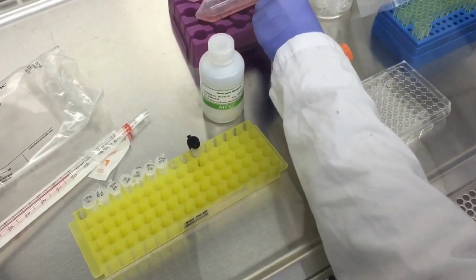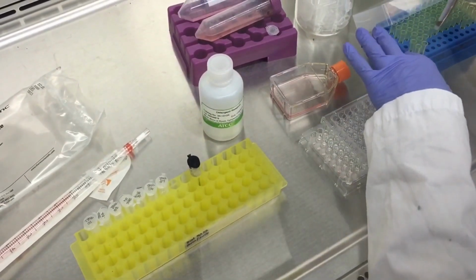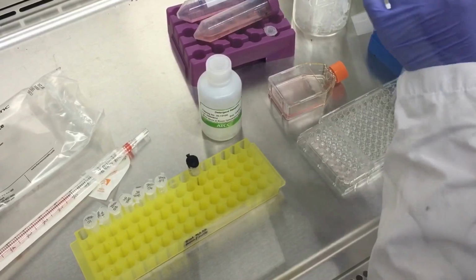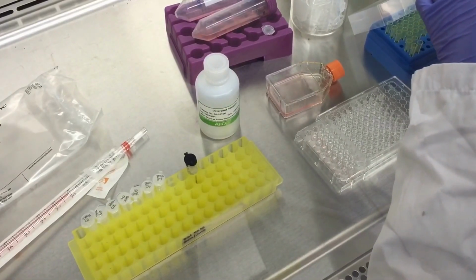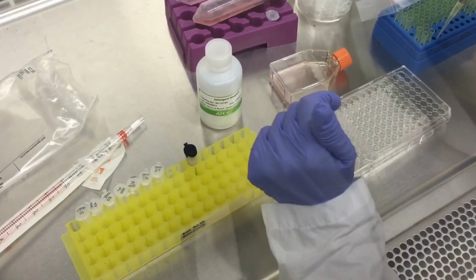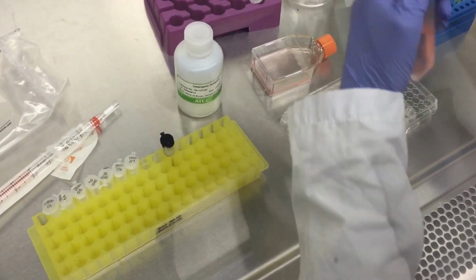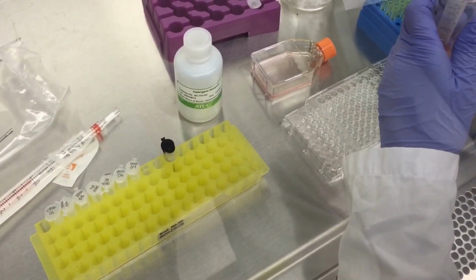Okay, after you're done plating the cells, you would now plate the media. In the first 2 columns, since it's our negative control, we'll only plate in cells and media.